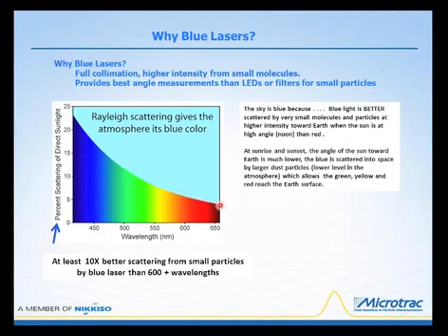And this doesn't take it all the way up to 780 nanometers, because this is the visible spectrum. But you can see that the scattering from the smaller particles is much greater. In fact, the scattering from the blue lasers compared to the near-infrared or red lasers is at least 10 times better from those small particles. But this is the reason why our sky is blue.